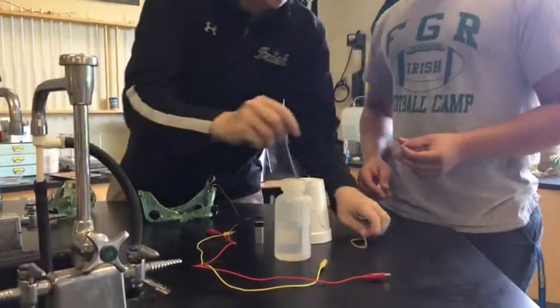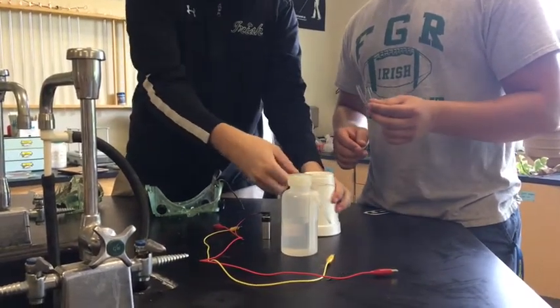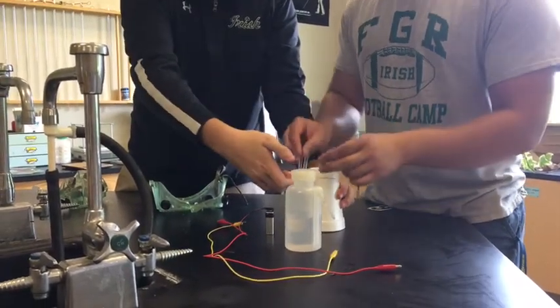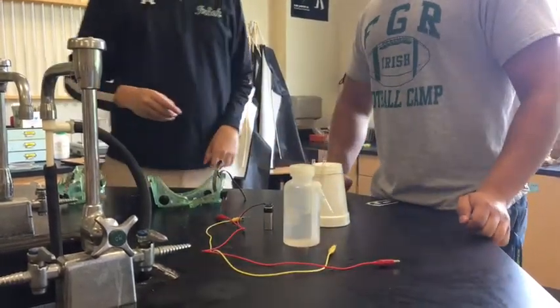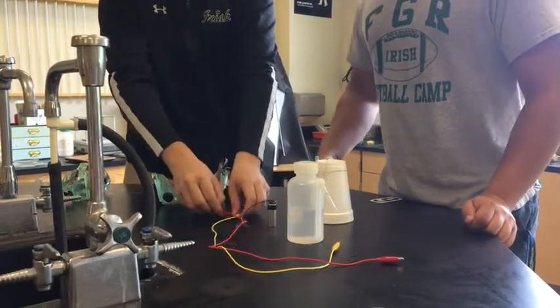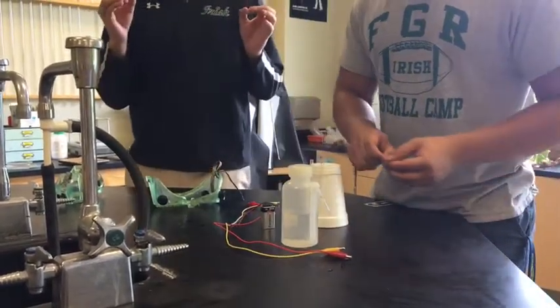So you set up your lab like this — you go around your styrofoam cup or beaker; in this case we have a styrofoam cup, either would work. You put the U-tube in and then you pin it like that. Your chemicals would be inside your U-tube, and you have your battery on each side, so on these electrodes you would attach pencil lead and put them in each side.